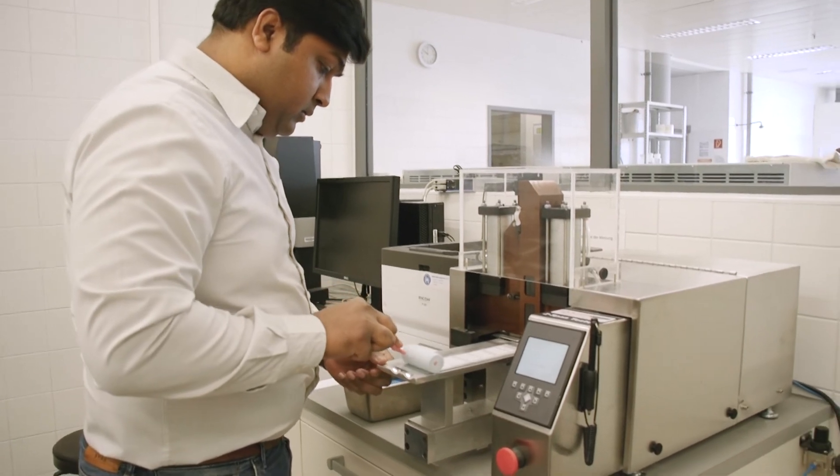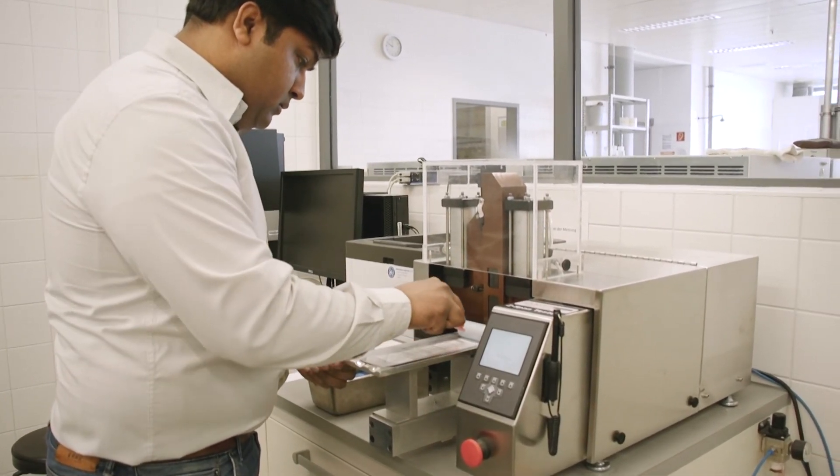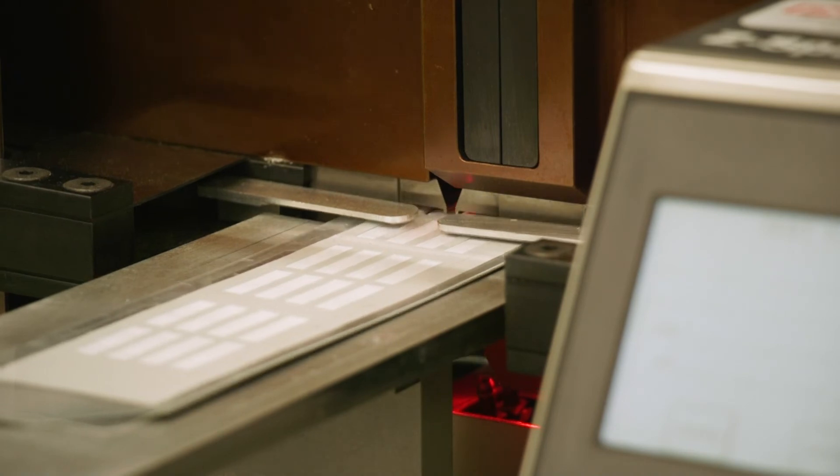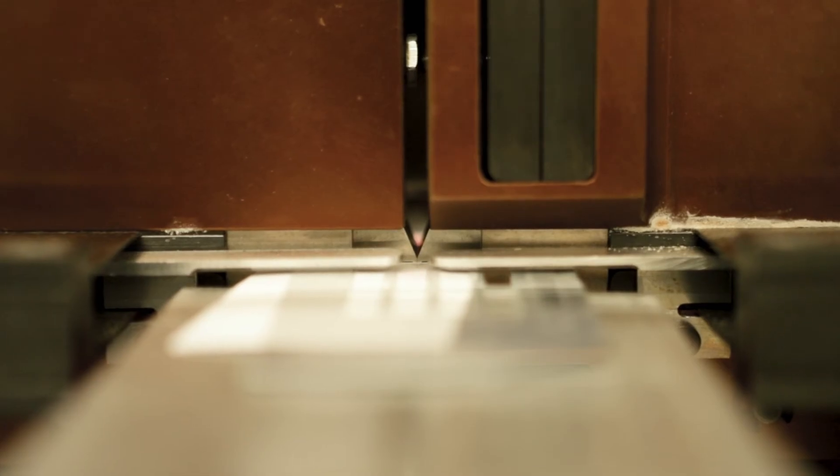A very interesting measurement, called the wet zero span test, can only be performed by a few laboratories. This is to evaluate the tensile strength of a single fiber.